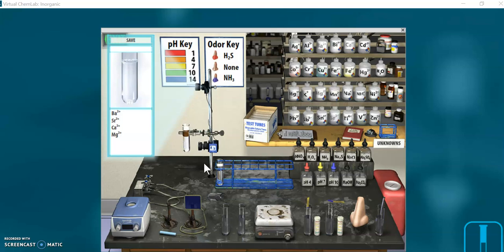Now, this is a known solution, but later you'll do these qualitative tests with an unknown solution. Okay, let's try some chemical tests out.